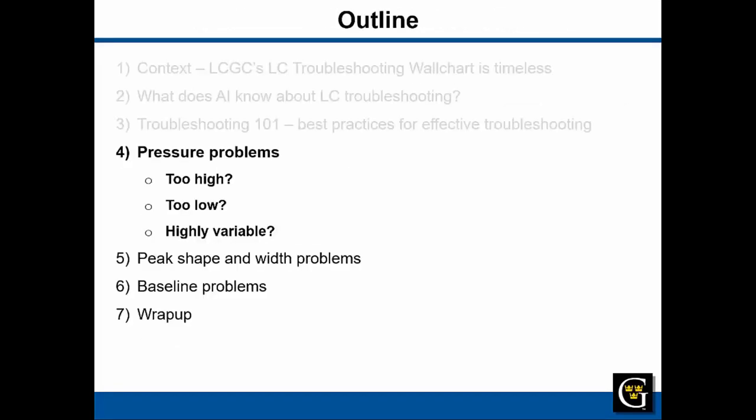Now, getting into some specific problems. The first category here is pressure problems, and I've divided these problems into situations where the pressure we see is too high, the pressure we see is too low, or the pressure we see is highly variable.